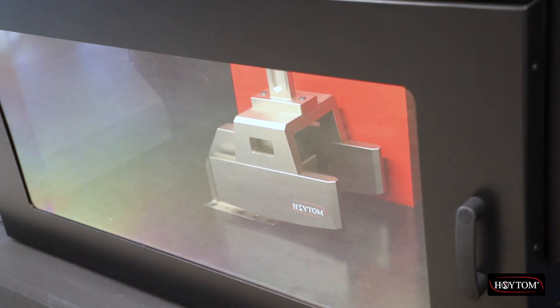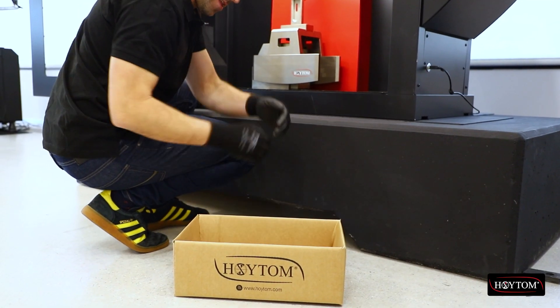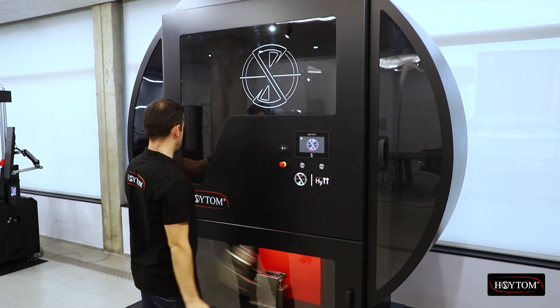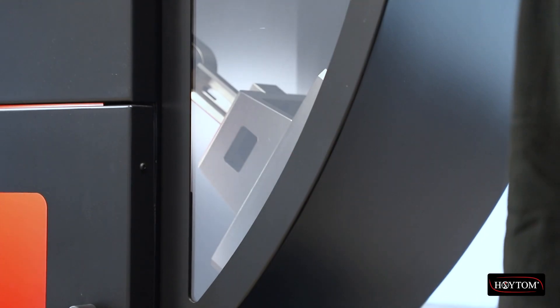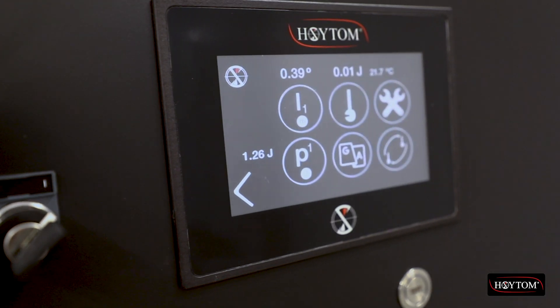The option to release the hammer in a controlled manner via the touchscreen facilitates maintenance and cleaning. In addition, all access doors to the pendulum are kept closed during testing to avoid accidents and opened only according to strictly controlled safe events, which can be triggered via the touchscreen.